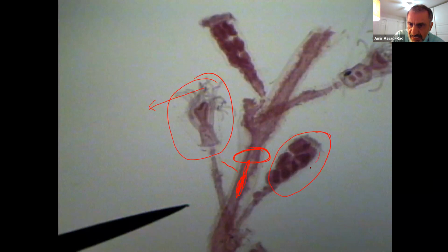And then the outer sac right here, as you can see, these are the Medusa buds. You remember we talked about this. You have the slide of it. They come out of the gonopore. Pore means opening, and gono means from gonad. So gonangium. And then the sac outside here is called the gonotheca. And the sac right here is called hydrotheca. Theca means sac.